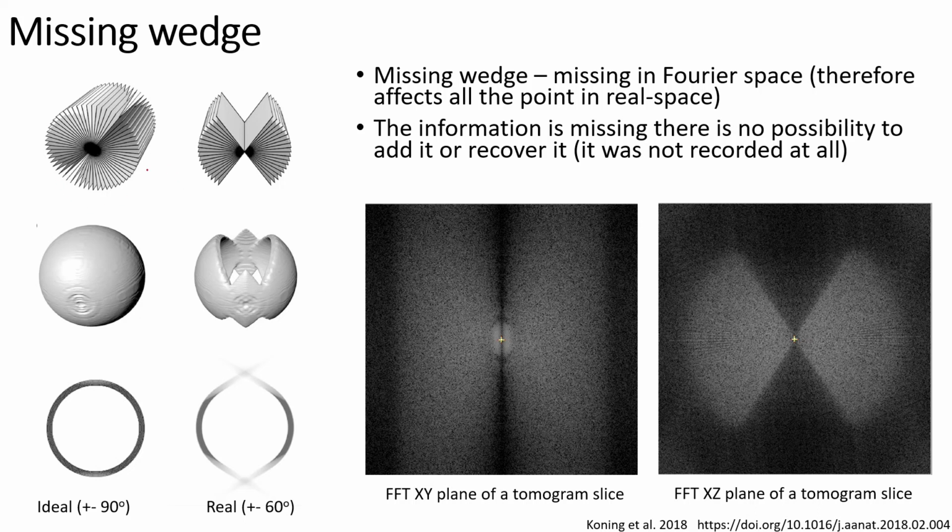Therefore, this ideal version of an all-around rotated sample and getting transmission images from the sample is idealistic and not possible in our setup. But if that would be possible, then if we had a small ball and we reconstructed it, we would get a very nice image of a ball that would be completely circular without any missing information.